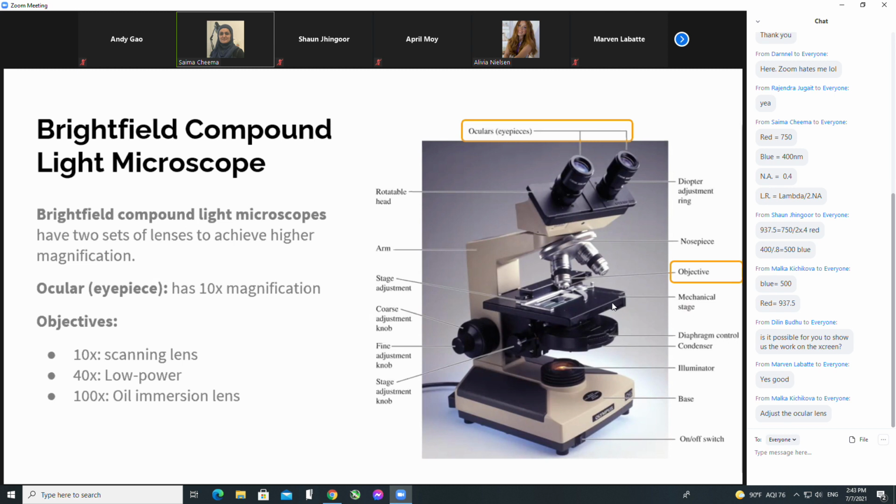And yes, absolutely. Generally, the way to do it, if it's the stage that moves, and sometimes it depends on what moves, but generally it's the adjustable stage.